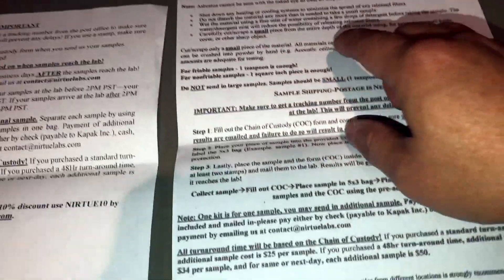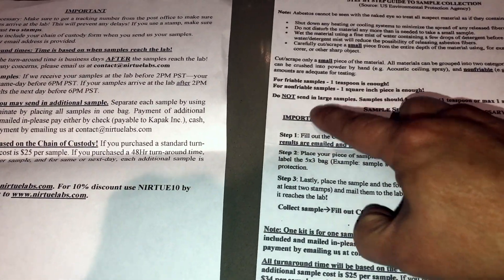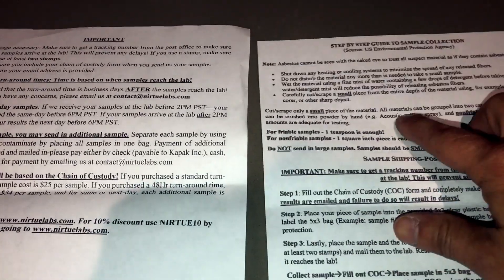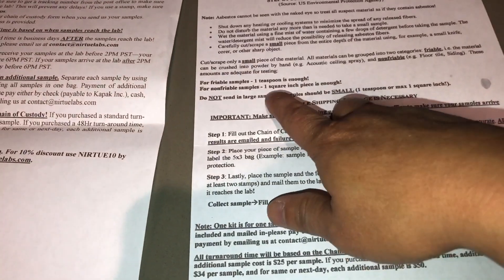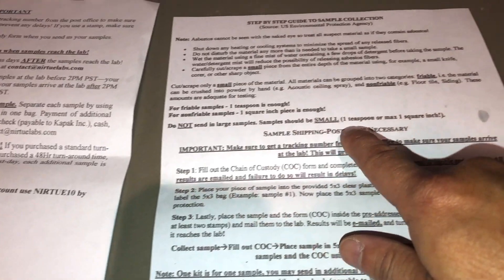The form has your address and the step-by-step instructions concentrate mainly on the size of the sample. There are two categories: friable — materials that can be crushed into powder by hand, like acoustic ceiling spray — and non-friable, like floor tile or siding, which you can't just pulverize by hand. For non-friable samples, about one square inch is enough.